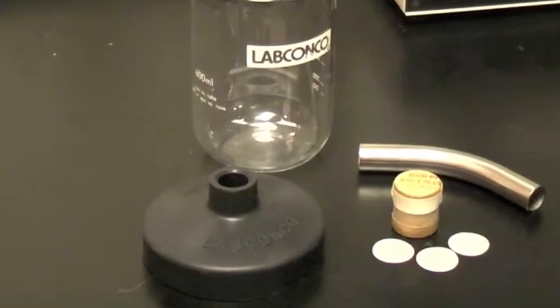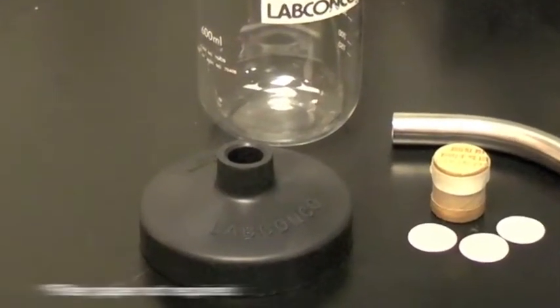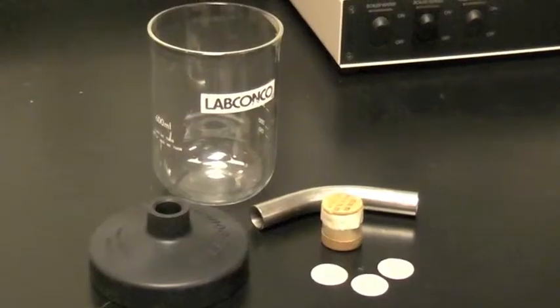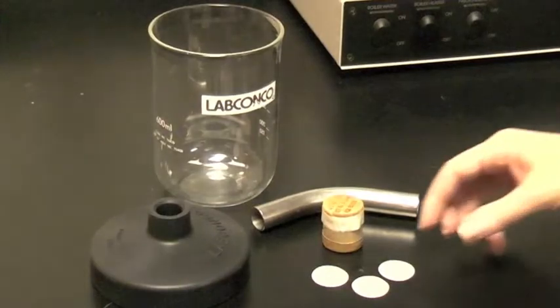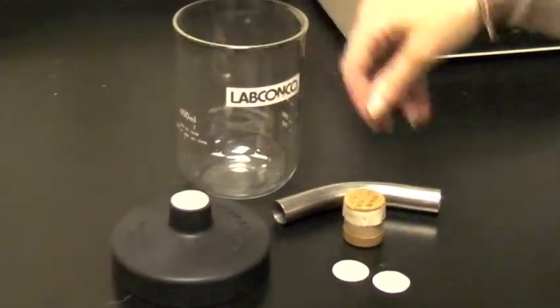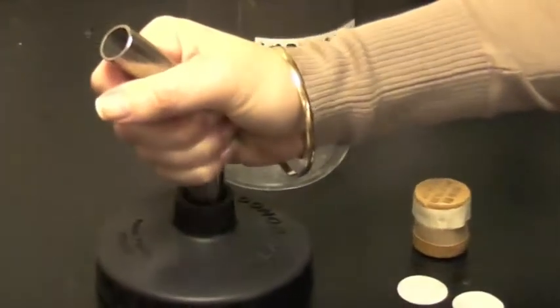To install an adapter and filter paper on a fast freeze flask, place the black rubber flask lid on a flat surface. Place a piece of filter paper over the opening of the lid, then push the paper into the lid using the adapter.